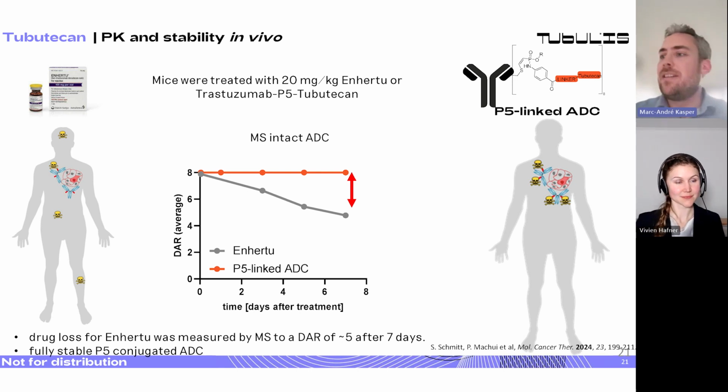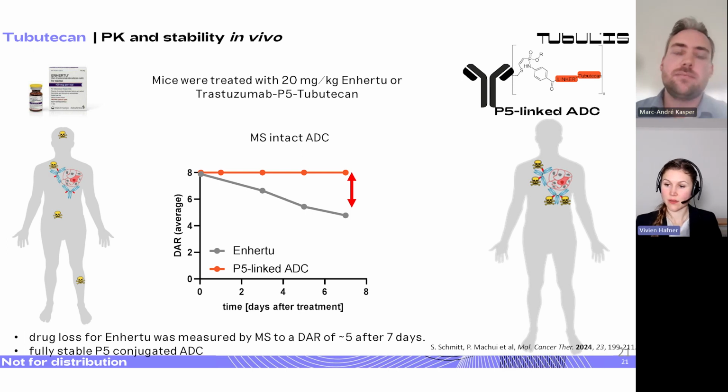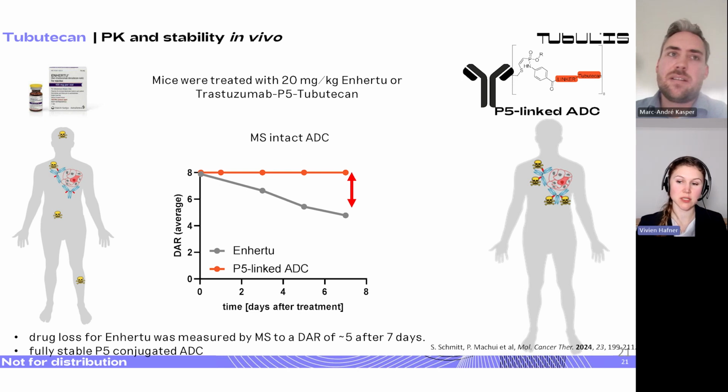One could think that if you remove the covalent bonds between the chains, they would fall apart. But as I said, since the non-covalent interaction can compensate for it very nicely, it's not an issue. And why do you think that this does not affect free cysteine conjugation from the variable domain and also not the eventual binding of the antibody?